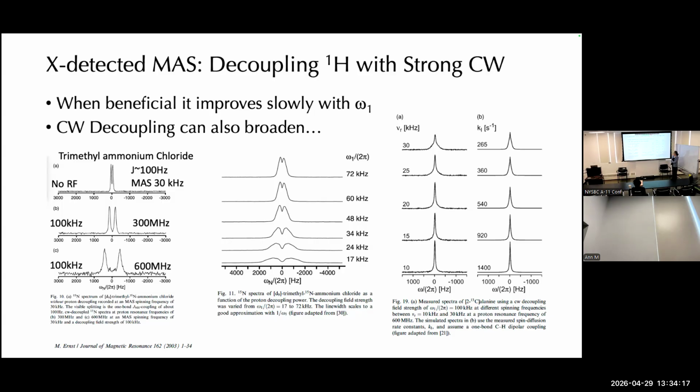on the alpha site. And for some reason, the CW decoupling is 100 kilohertz, just chosen to be that. And then you vary the spinning frequency. And you can see that the spectra look a lot better if you spin slow. See that? Take a minute. I don't mean to rush you guys. I don't need extra time today, so don't hesitate to stop me or ask me to repeat. These are simulations.